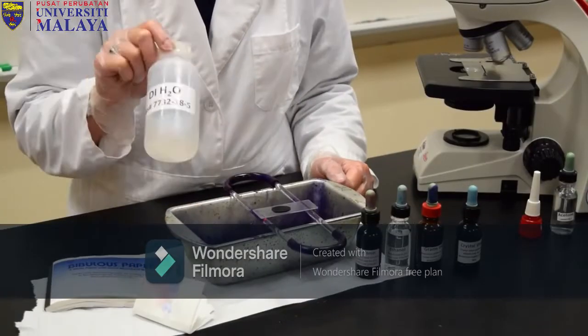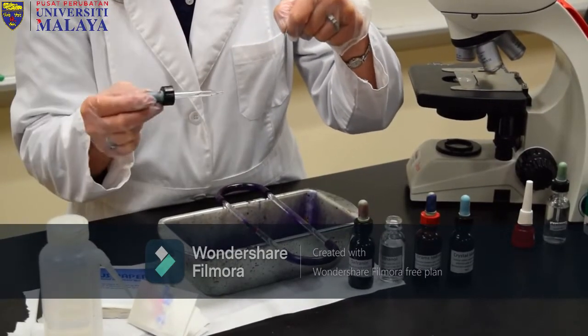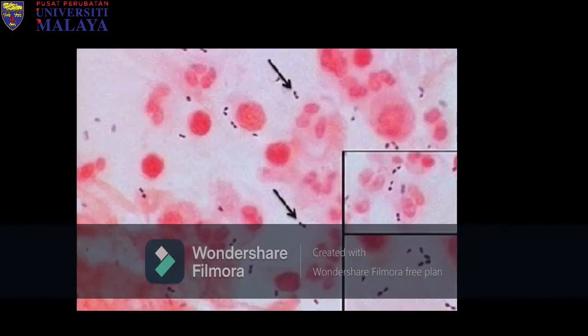After isolation of colonies in culture media, CSF gram stain is performed. Gram-positive organisms will appear dark violet or purple in color, while gram-negative organisms will appear red or pink in color, which is from the counterstain. Figure 1 is the picture of gram stain of Neisseria meningitidis in cerebrospinal fluid CSF with associated polymorphonuclear leukocytes. Next, figure 2 shows a gram stain of Streptococcus pneumoniae with white blood cells.